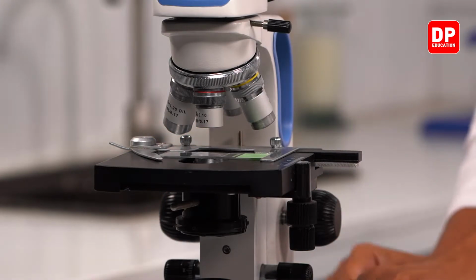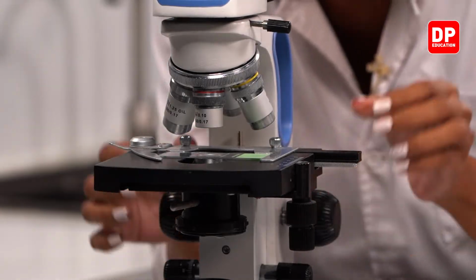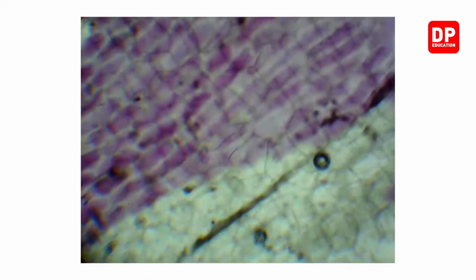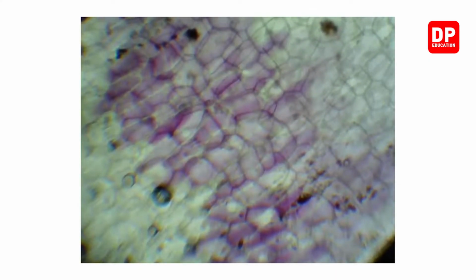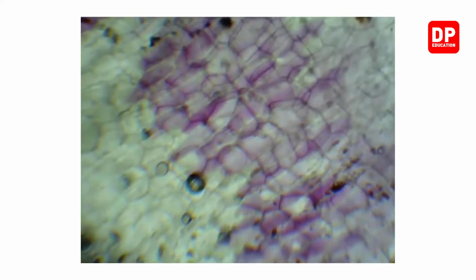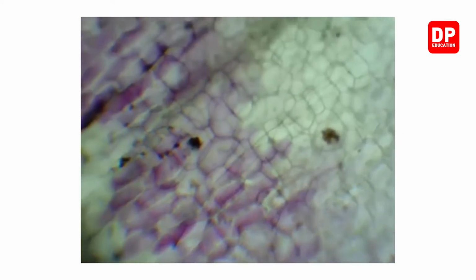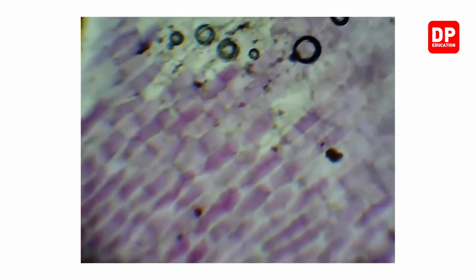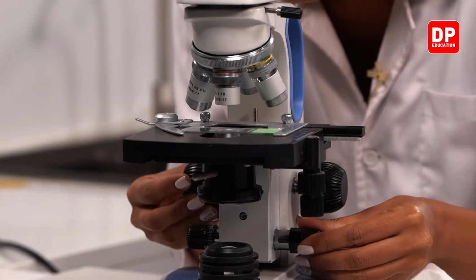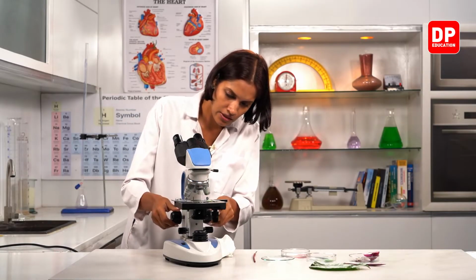Right. I need to turn on the lights and observe. Right. So my low power is not enough. Using the rough adjustment knob, I'm going to take it a bit down. Right. So I'm going to turn it to the medium power.